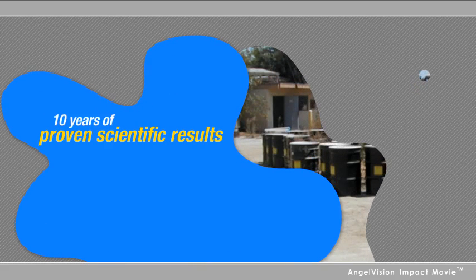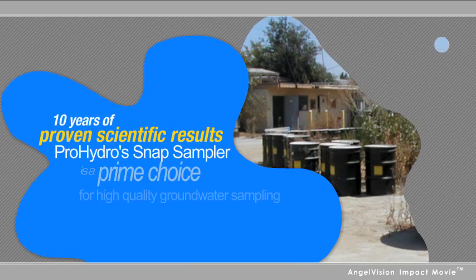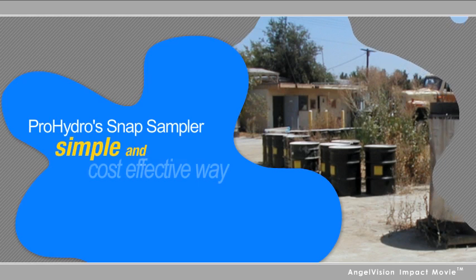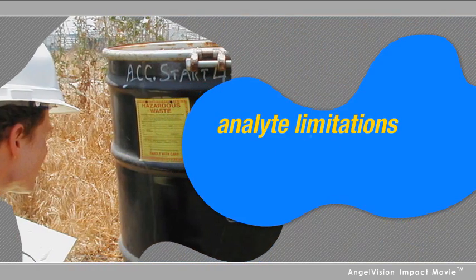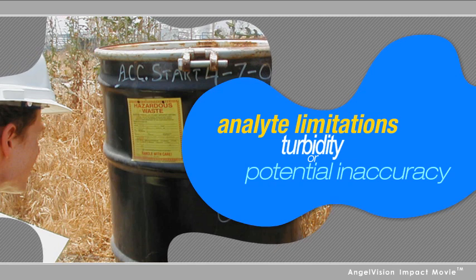With 10 years of proven scientific results, ProHydro's Snap Sampler is a prime choice for high-quality groundwater sampling. The Snap Sampler is a simple, cost-effective way to collect accurate groundwater samples, without the effort and waste generation of purge sampling, or the analyte limitations, turbidity, or potential inaccuracy of other no-purge sampling methods.